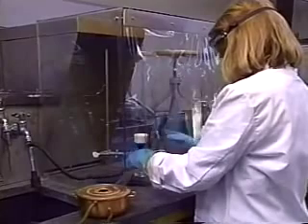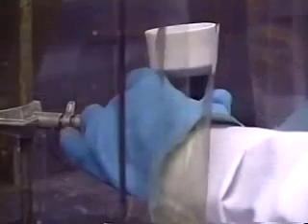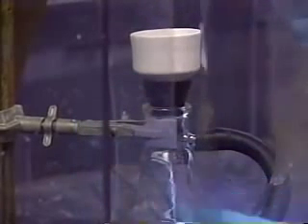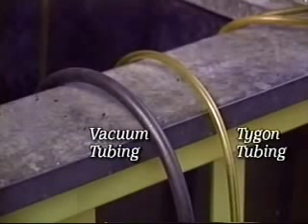Use a piece of vacuum tubing to connect the flask to the vacuum source. Do not use Tygon tubing, as it will collapse under vacuum.